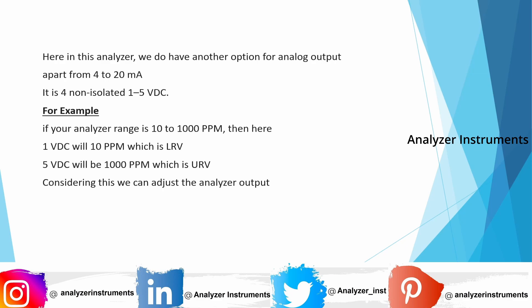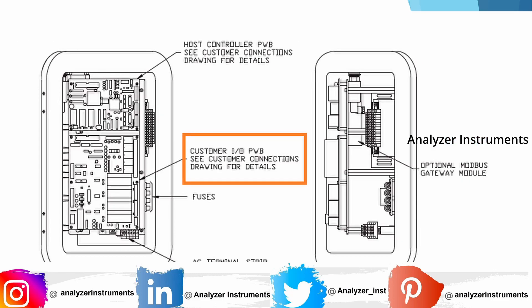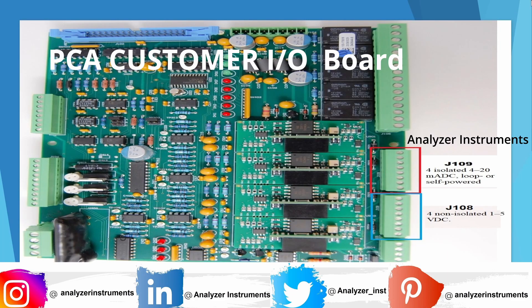Before adjusting the analog output, we will look at how the analog output board looks. The analog board is located in the lower compartment of the analyzer — as you may know, the analyzer has two compartments. This is how the analog board looks. Here we can see J109, which has 4 isolated 4-to-20 milliamp outputs that can be self-powered or loop-powered as per our requirement. We also have J108 terminal, which is for 4 non-isolated voltage DC outputs.